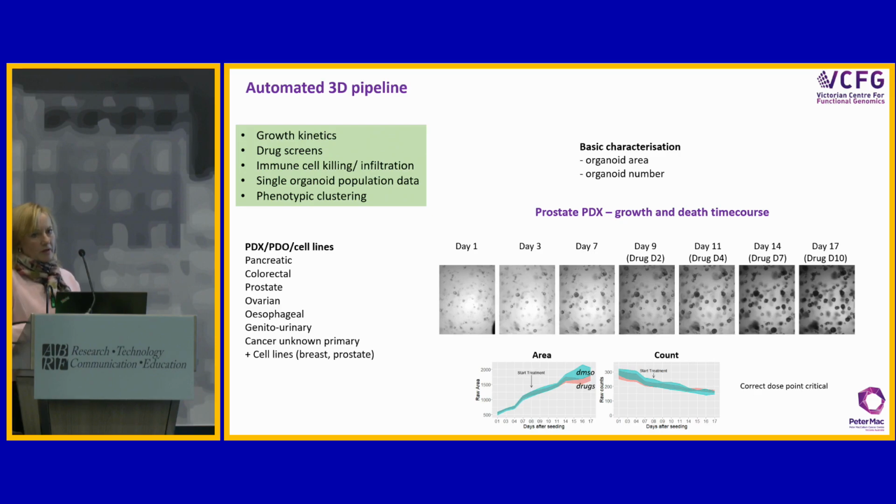The important thing about that is that people wait till their organoids look nice and big and juicy and ready to go, and that's the wrong time to take them because they're no longer able to take up the drugs. So you really want to be hitting it down here when you're in that growth phase so that you can dose and leave for as long as you need to.